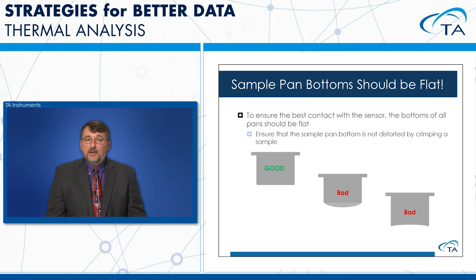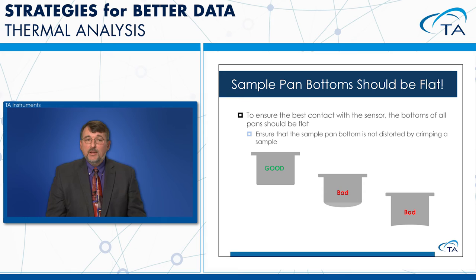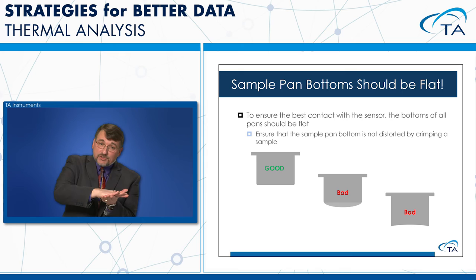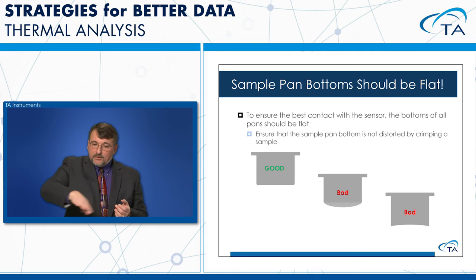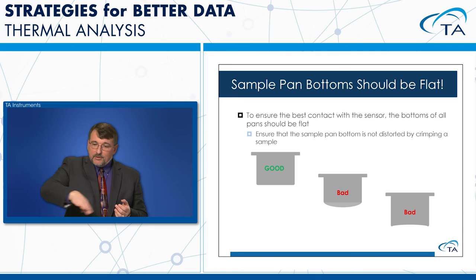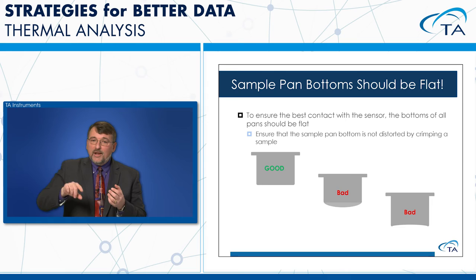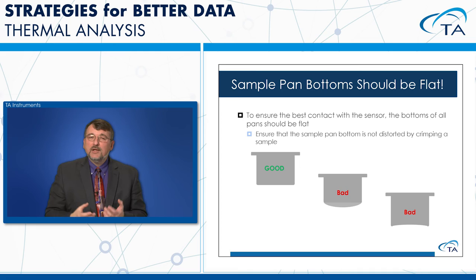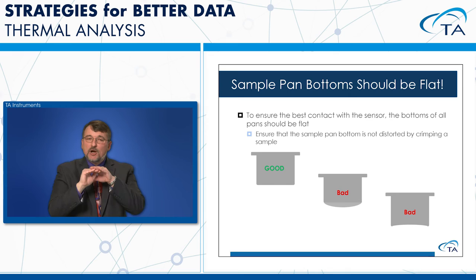The bottom of the sample pan needs to be flat. T0 pans maintain flat bottoms that sit on the flat sensor for best thermal contact. If too large a sample causes the pan bottom to curve, the pan can rock on the sensor. If the pan is crimped unevenly and curves, it also won't sit flat. A flat pan on a flat sensor gives the best thermal contact and best performance.